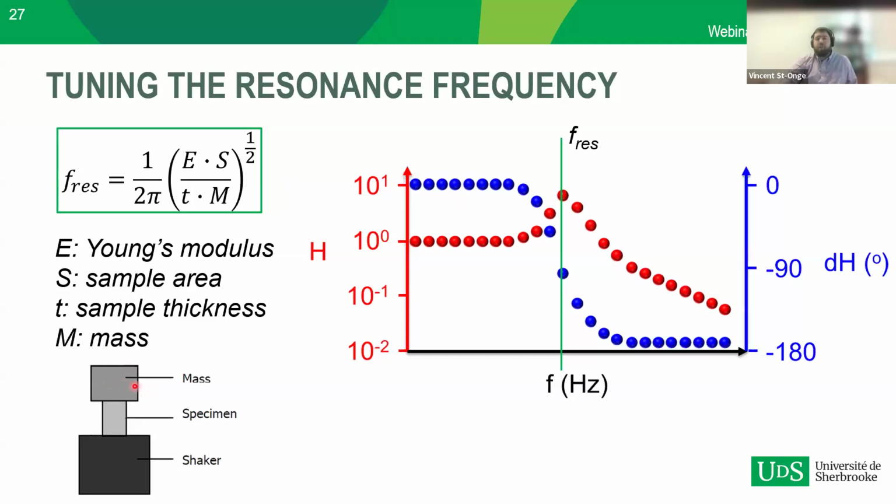The mass that you saw in the videos was an aluminum mass that weighed 5 gram, on which we add the 4.7 gram of the accelerometer. So a total of 9.7 gram.